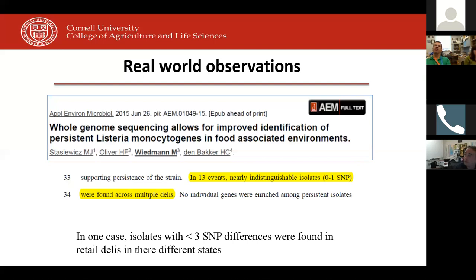So this is obviously relevant for both case study 1 and case study 2. While I've not seen any clear evidence, it would not be impossible to find the same Listeria monocytogenes in processing facilities, whether it's introduction from raw material, introduction from ingredients, maybe even introduction through people that move between facilities. This has never been shown or proven, and while it is potentially unlikely, it is not impossible. And at some point, we might pick up some cases like this as we do more whole genome sequencing. And sometimes it may become the epidemiologists, at state or county level, that don't really have to drive these investigations, to find some of those links that we have not thought about previously. Okay.